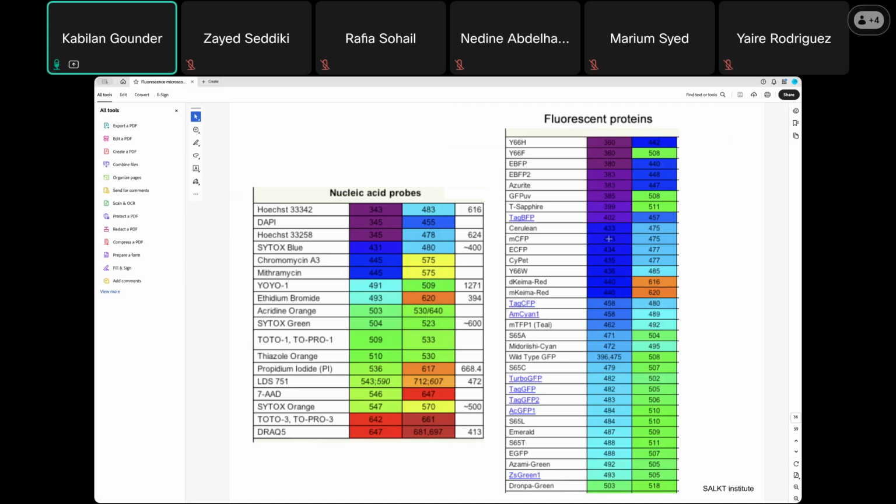So our goal is to study protein, nucleic acid, and other things: how it is expressed, where it is expressed, and whether its expression decreases or increases. You will get all of this from fluorescence microscopy. Also, you can see cellular events. You can also do multicolor imaging, seeing more than one protein or other lipids as well. So this is more important.